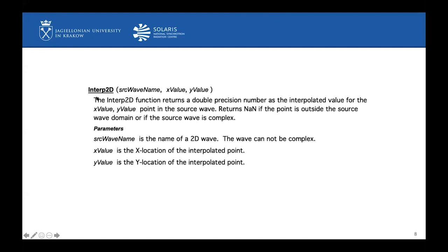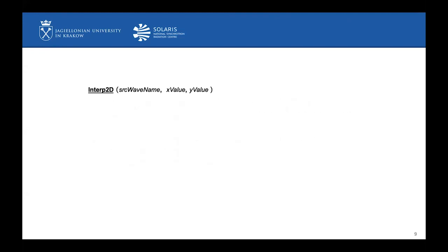And we will focus on this interp2d command. So let's see how the syntax should look like. And it should be like this. So here is our final data, which is scaled in the K-space, and it is equal to the results of this operation.